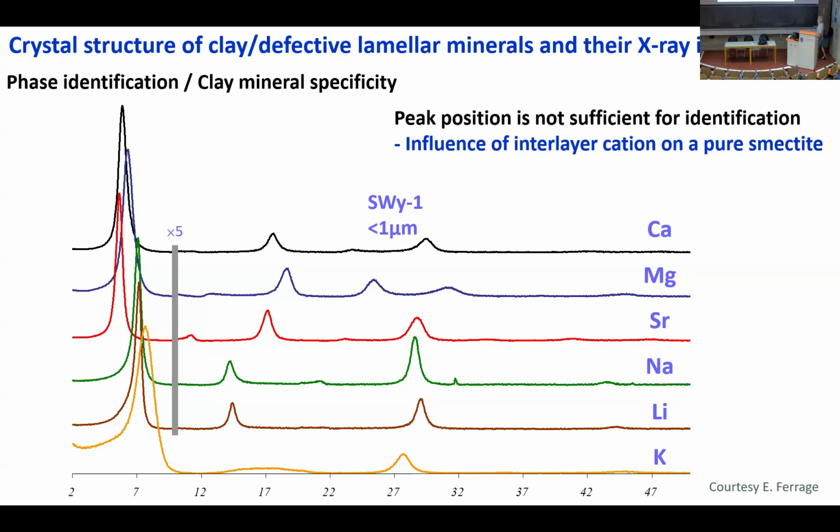This is one example, but another example could be to think about possible intercalation of either other metal cations or organic cations or other organic molecules in the smectite interlayer. And in this case, you want to make sure where you start from. And for this, saturating all interlayers with one single cation is clearly something you want to do.